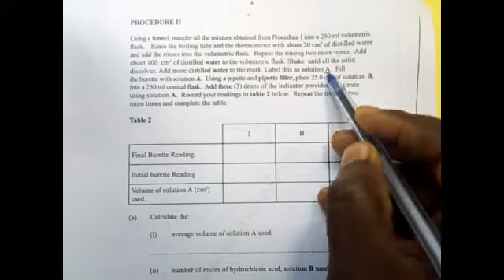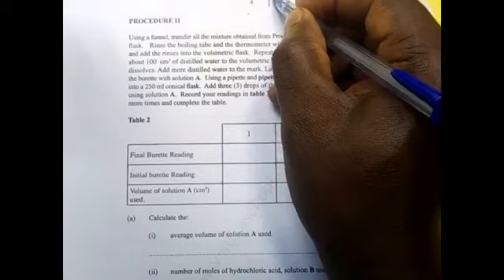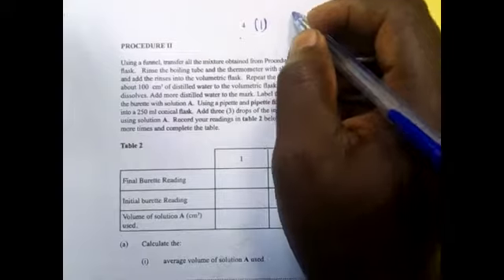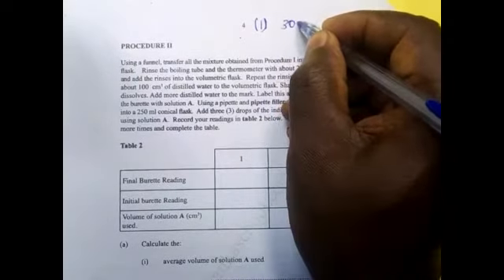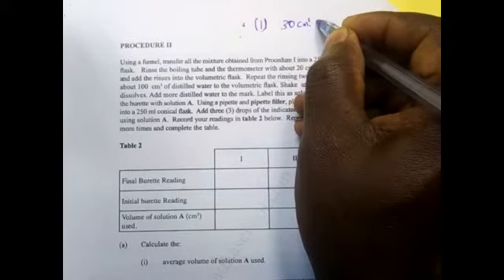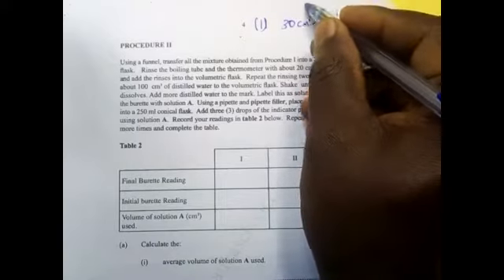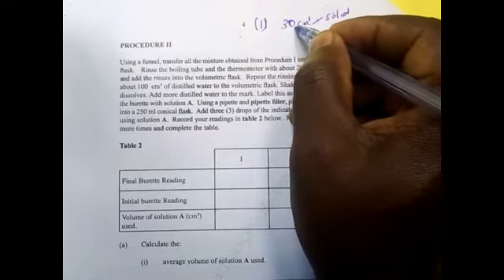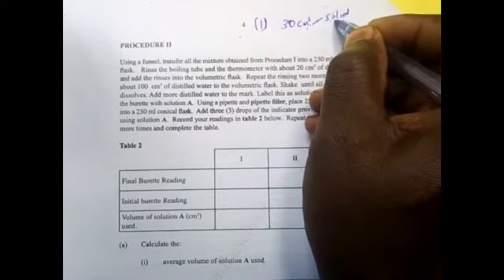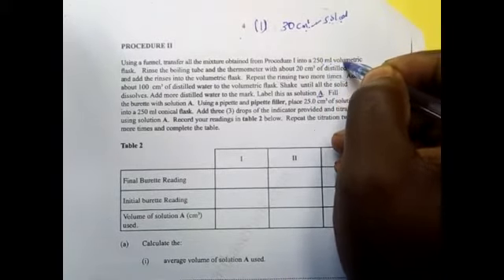So up to that point, I want to help you understand one thing: from procedure 1, we add 30 centimeters cube of distilled water, dissolving solid A. So we are transferring 30 centimeters cube of solution containing solid A into a 250 ml volumetric flask.